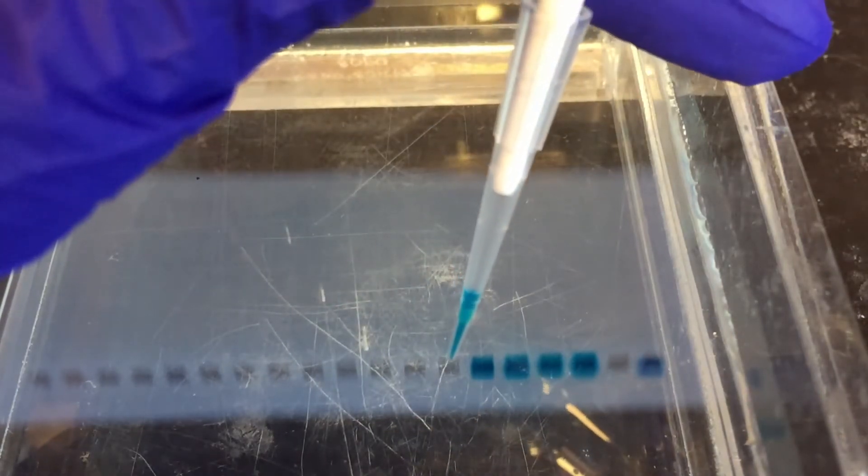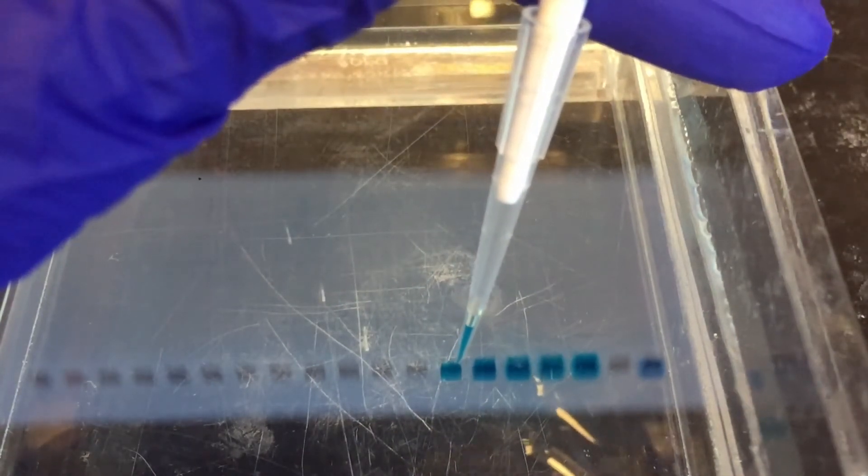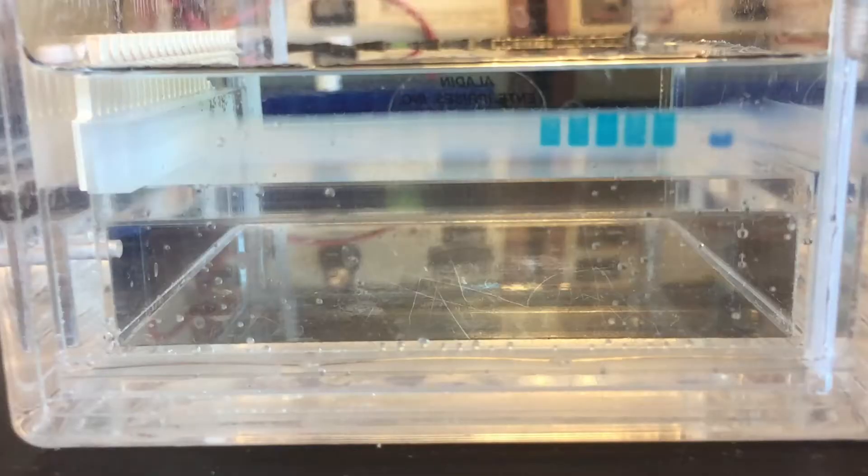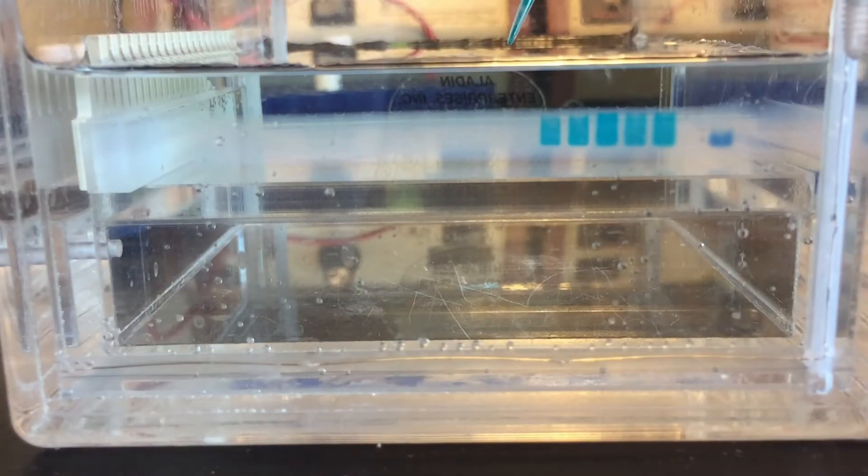You load the gel by placing the tip as close to the bottom as possible. And you slowly raise the tip out of the well as you're expelling the sample allowing it to sort of settle as you go.